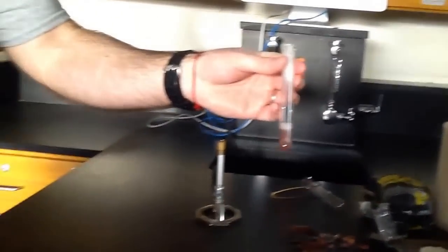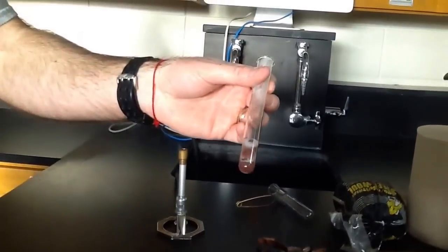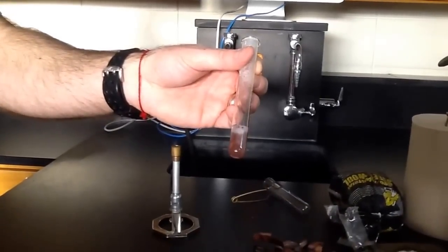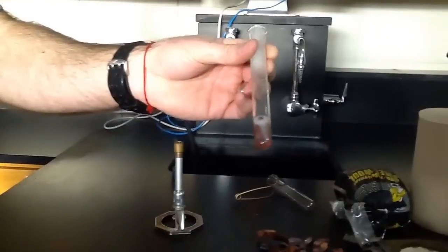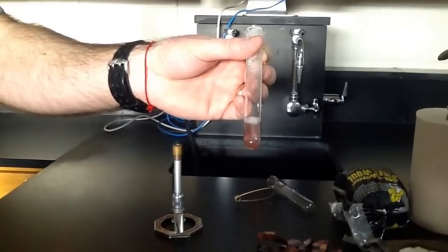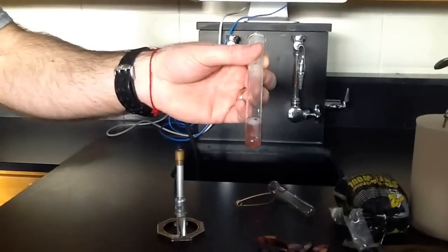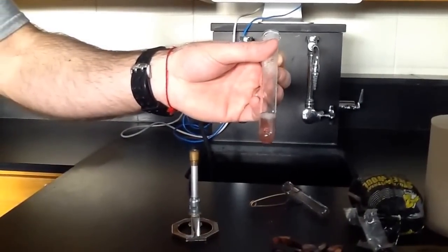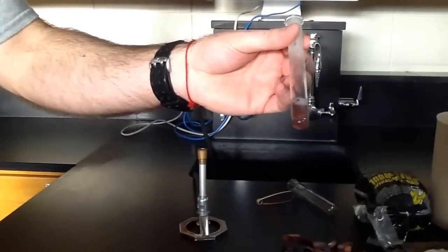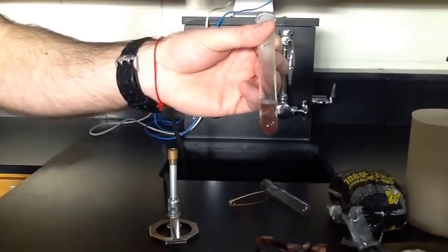Ooh, that's getting pretty warm. So you can see now, hopefully, a little bit more of the copper forming, and the liquid is pretty much clear at this point. It's a little hard to tell because the reaction is going so vigorously, and the heat that's being produced is causing those bubbles. It wasn't a gas that was forming. All right, so that's our single replacement reaction of aluminum and copper chloride solution.